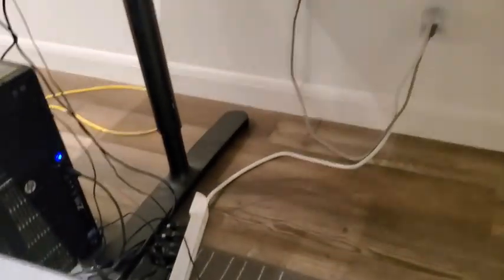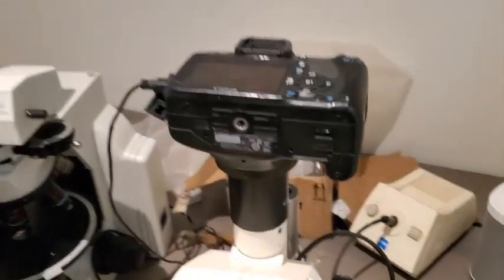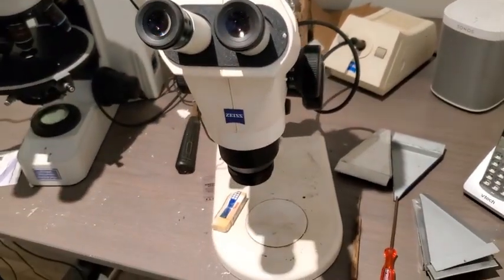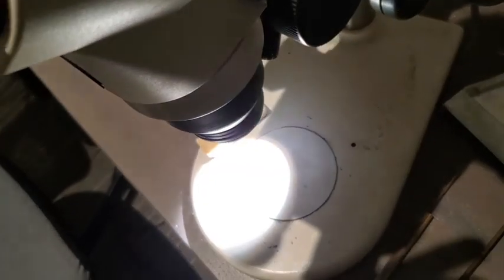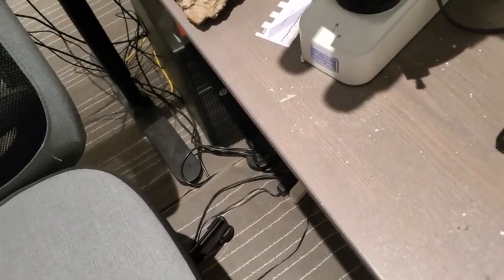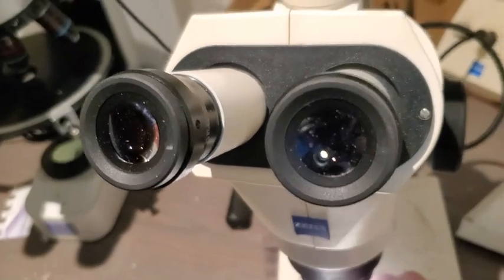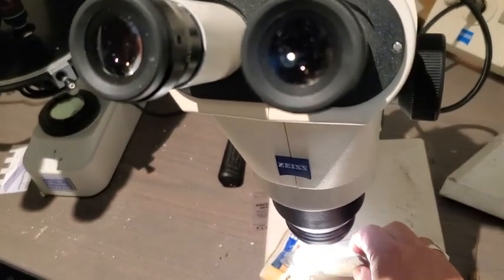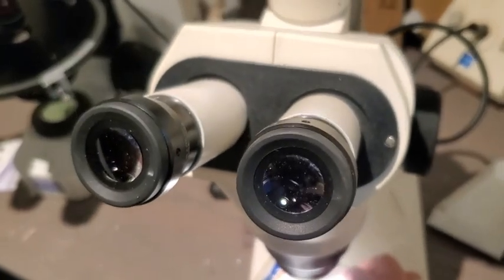All right, take the suitcase that I just kicked over out, and this is an incident light microscope. I turn on the light. You see it? Maximum. And then you can put your piece of rock there. And then we focus and look through the oculars. Can you see the oculars? Yeah. And then we can look at what the rock looks like. And I'll show you a photo of that later on.